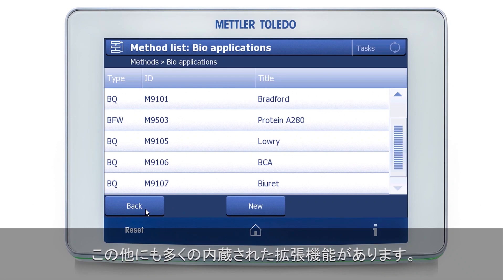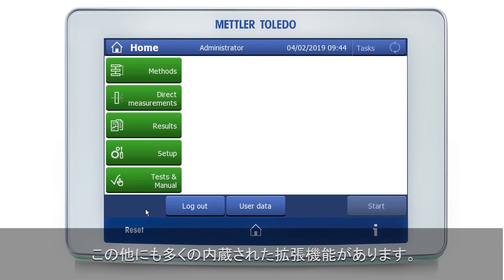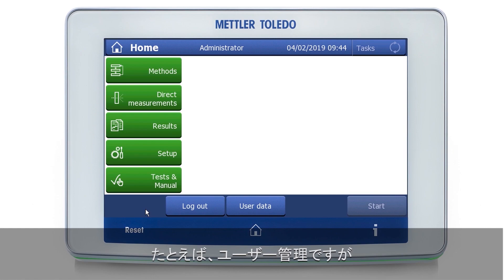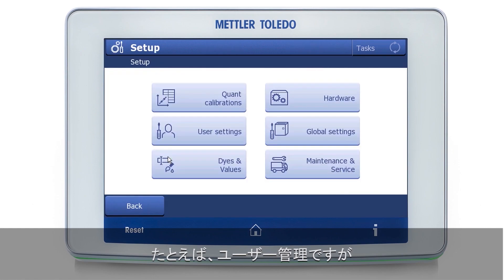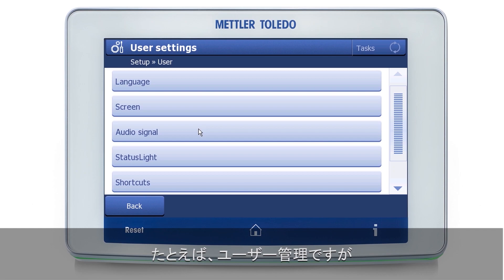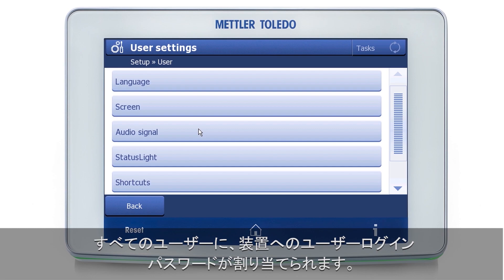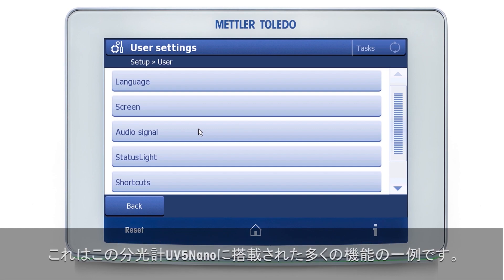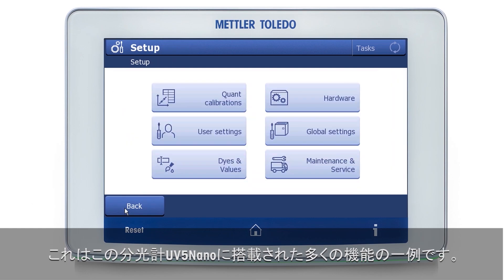The instrument of course has many other advanced features built in. For example, just to illustrate, there is fully-fledged user management built in. Every user has their password, login date, and so on. This is only an example of the many features built into this instrument.